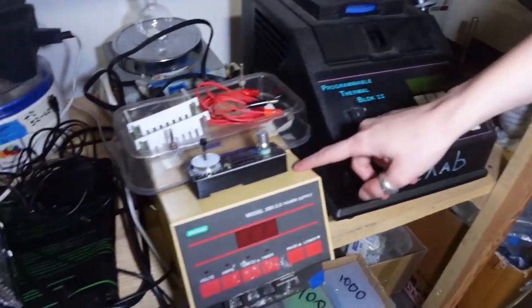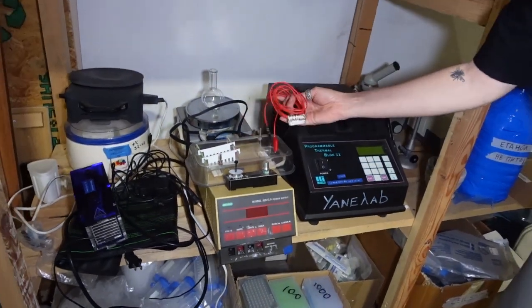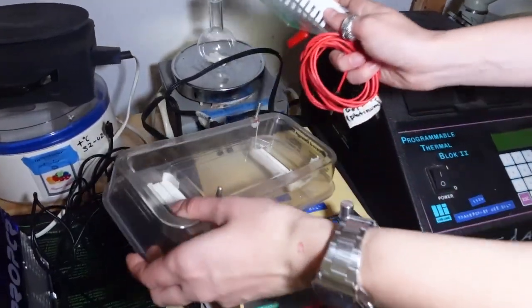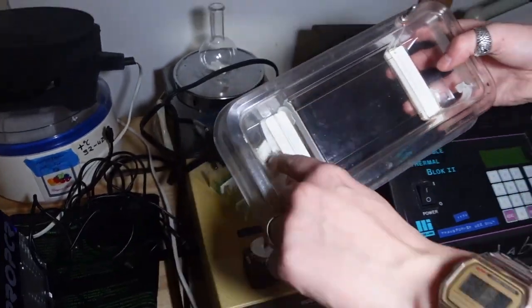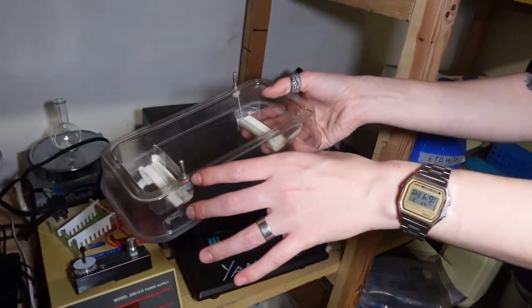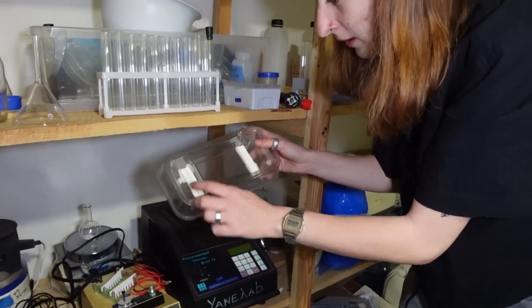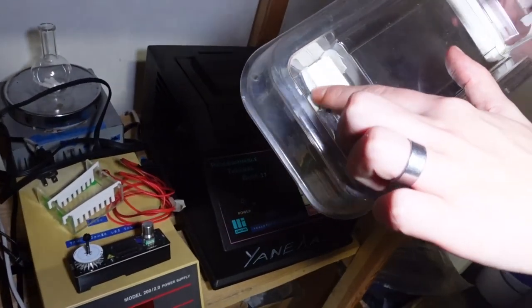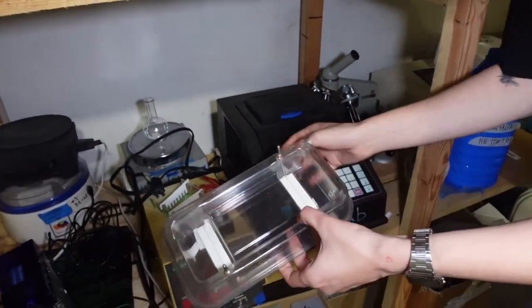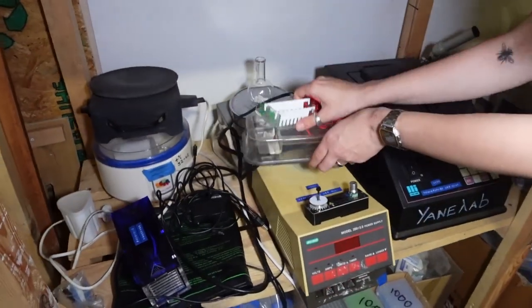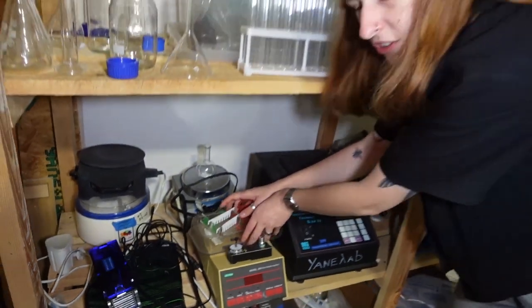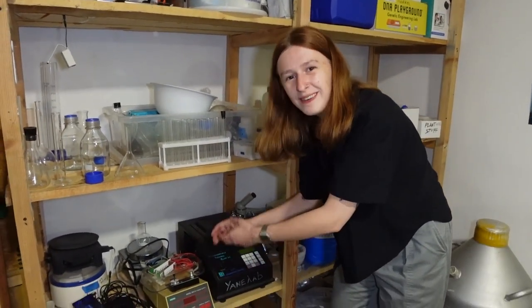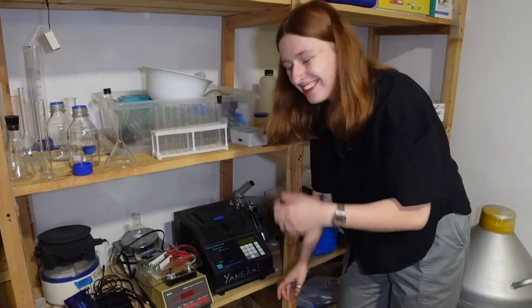I have this gel electrophoresis for separating and running DNA gels here. It was broken, I got it for free. This tray was broken so all the TA buffer was leaking but I just used some epoxy and cloth and I fixed the holes so works perfectly fine if you ask me. Still better than David's which is just a tupperware that looks disgusting.